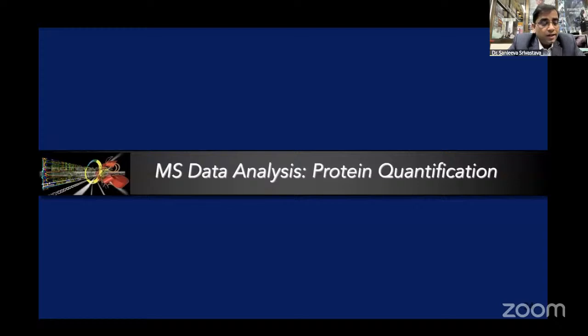So now in just the next few minutes, Amit will at least give you a flavor of a software, MSFragger, which all the participants here can also use on their own laptops, as it is open-access software. Timing is short, so Amit will just show you the interface of it, how the software looks. We have some other session where you can follow up on the data analysis part. So Amit, please show the MSFragger software now.